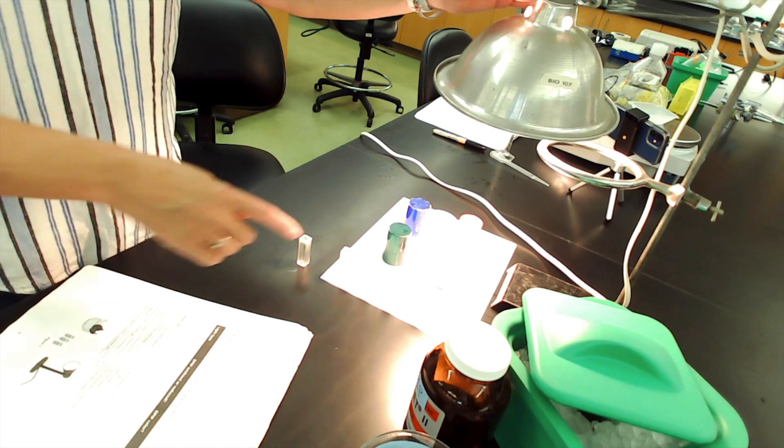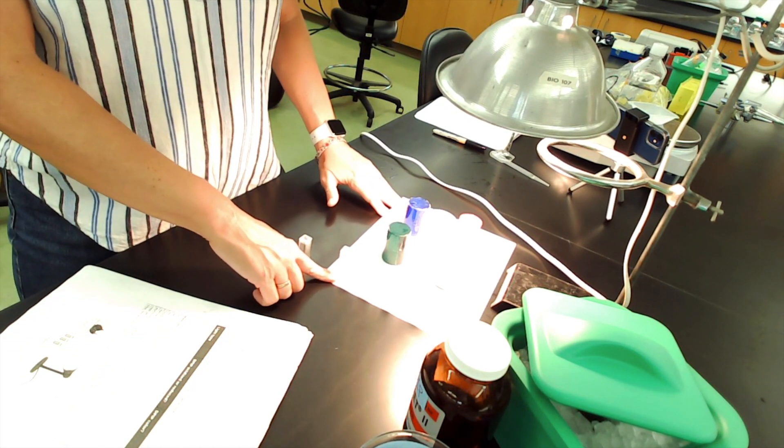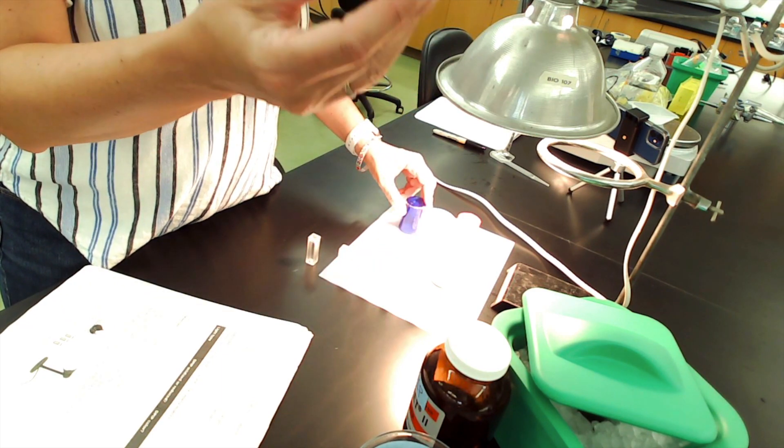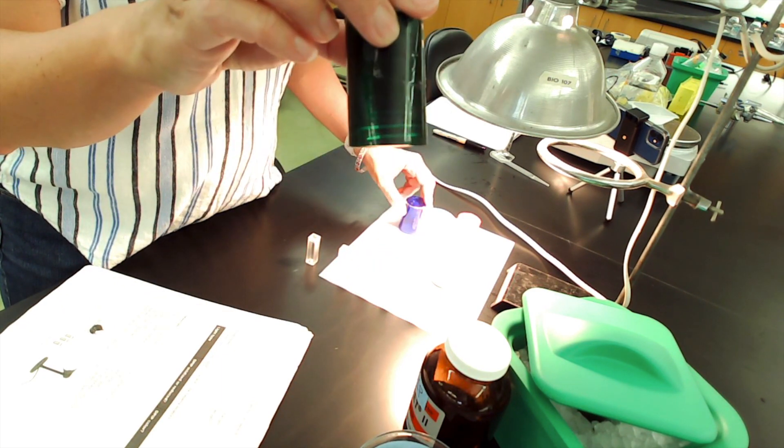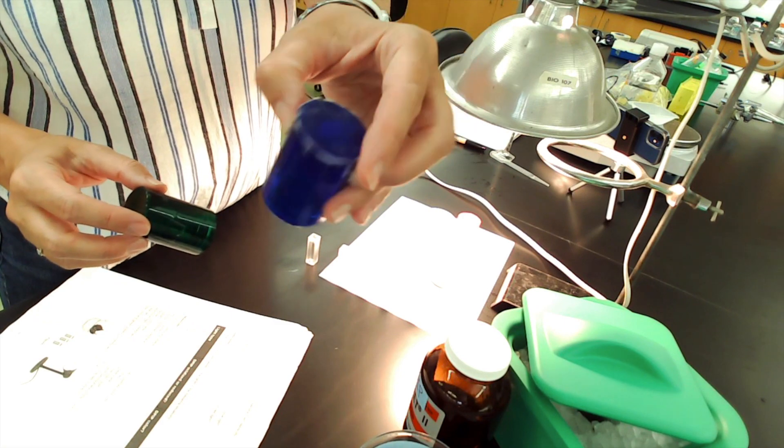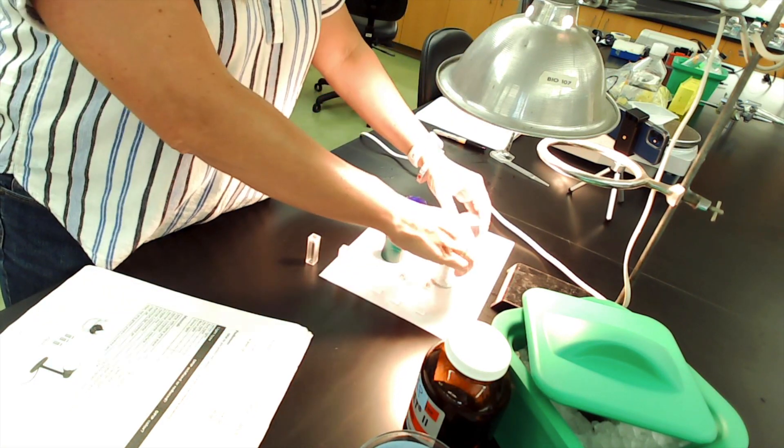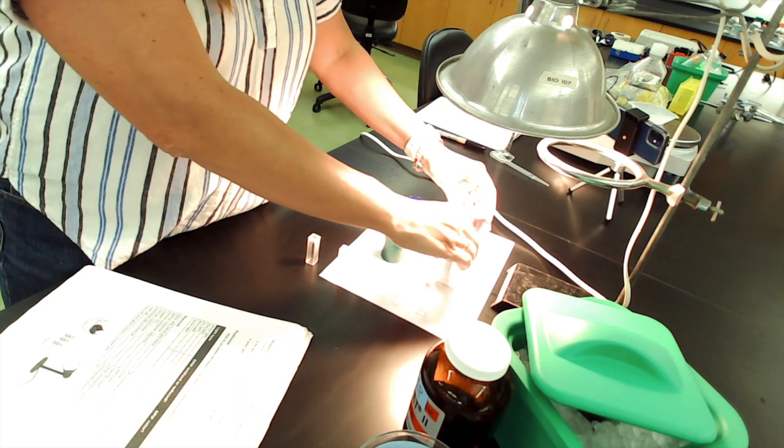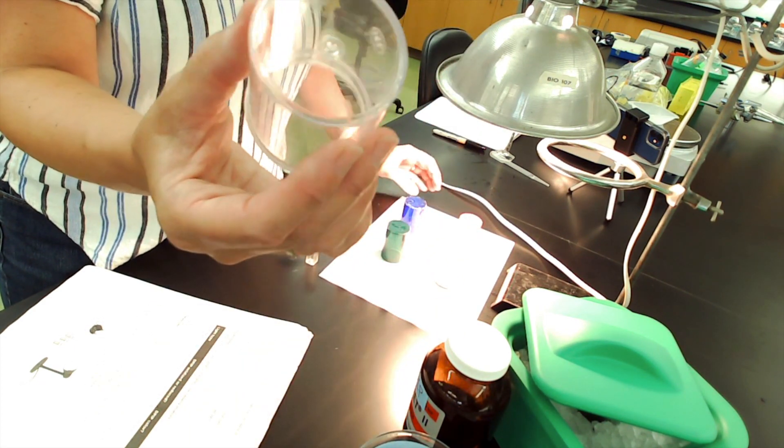The light is now shining on a piece of paper. On the piece of paper are these little plastic cups. There's a green cup, a blue cup, a red cup, a silver colored cup. This is supposed to be dark. And then this clear cup is the white cup.